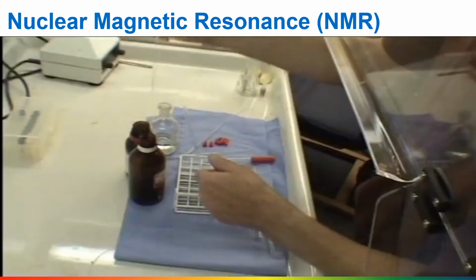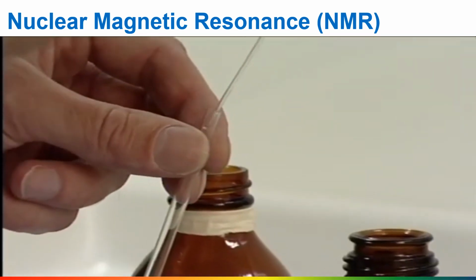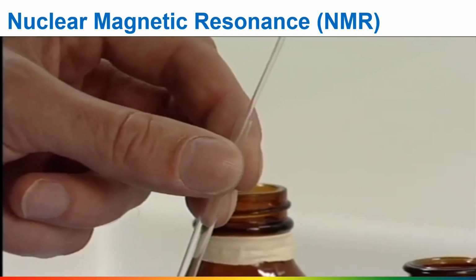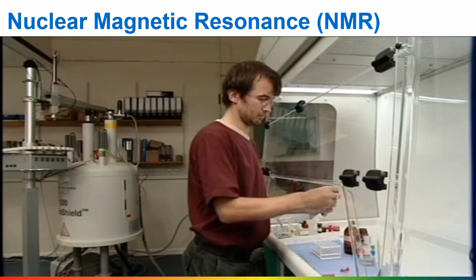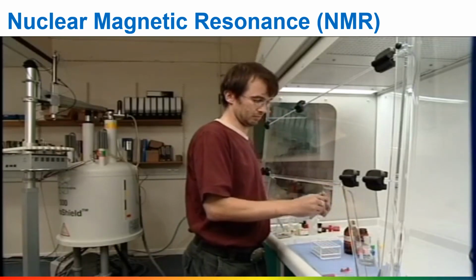Each molecule of this has 12 hydrogen atoms, all in exactly the same environment. The signal from these is taken to be the zero of the spectrum and has the value of 0 parts per million.